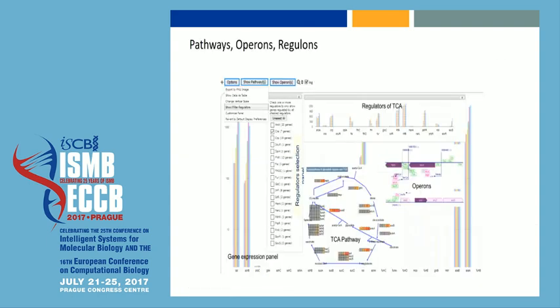Another set of visualizations is available from within the dashboard. When at the pathway level, you can request a view of the pathway showing all omics measurements for each gene. You can also ask for an operon view of all the genes in that pathway, or a similar plot of all the regulators for the genes in that pathway, where regulation information is queried out of the pathway genome database. For example, looking at the TCA cycle, you can see expression levels of every gene that regulates a TCA cycle gene.